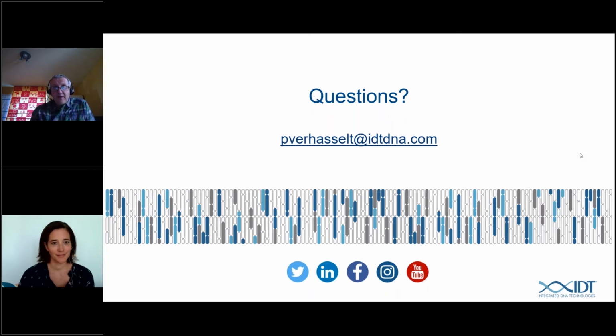Okay, I think we have to discriminate between two parts of the complete workflow. There is a Prism library prep kit, which is available off the shelf. If we're talking about the panels that are used for doing the capture reaction, a lockdown panel such as Simon has used, that takes about two or three weeks from design to arriving in the lab for use.